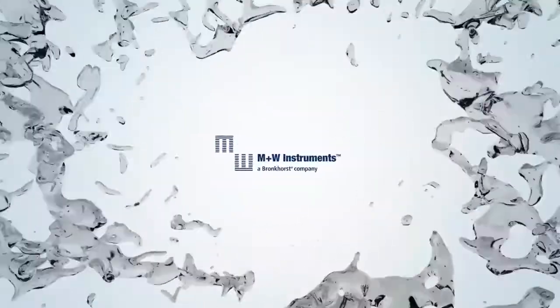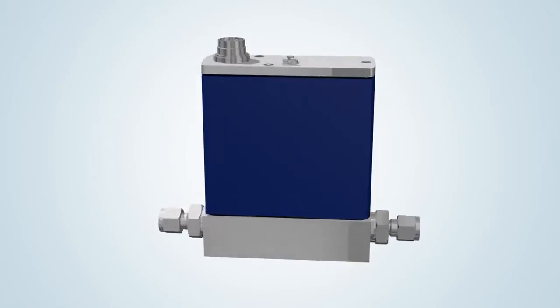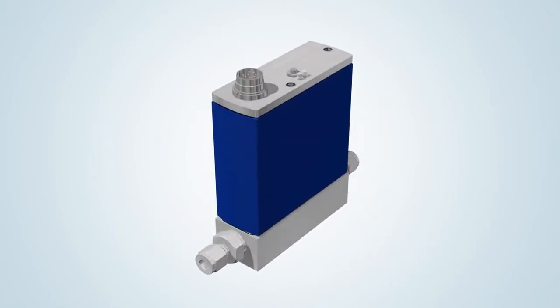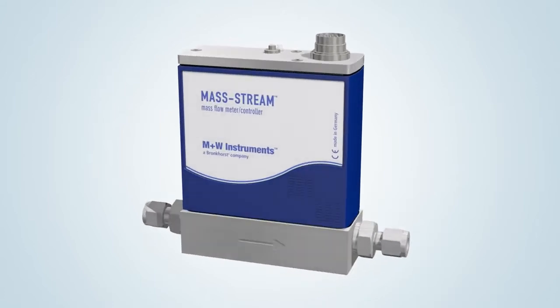In this video, M&W Instruments, a daughter company of Bronkhorst High Tech — the market leader in the field of thermal mass flow meters and controllers — presents the operation of the Mass Stream series of thermal mass flow controllers, employing the direct through-flow measurement technique.